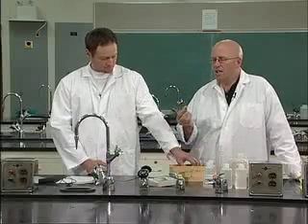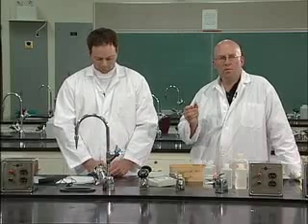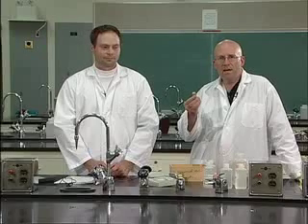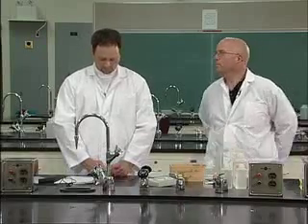So to figure out the density of any solid, we need to figure out what the mass of that solid is, and we need to figure out the volume of that solid. So density, as we've talked about in class, is mass divided by volume. Is that right? Mass per unit volume is exactly correct. Mass per unit volume. So we need to figure out the mass of this thing and the volume of this thing. Mass isn't that bad, we just have to weigh it. So Scott, why don't you pick a numbered metal sample and weigh it for us.